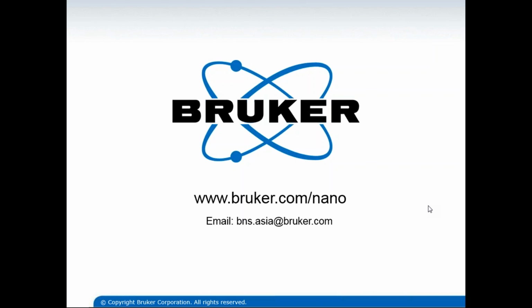Okay, thank you, Richie. There is a question on what is the principle for non-contact roughness measurement? Okay, it's based on the interferometric technique. So our 3D optical microscope is based on interferometry.